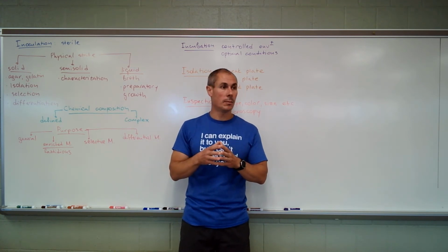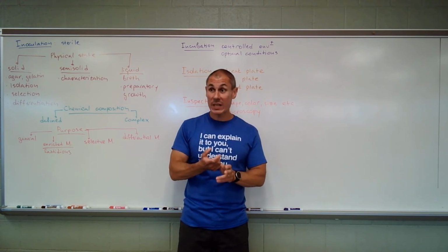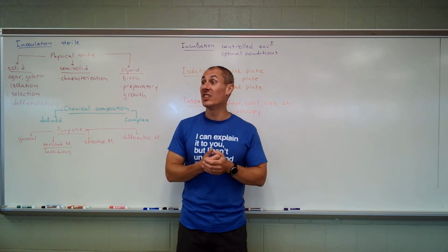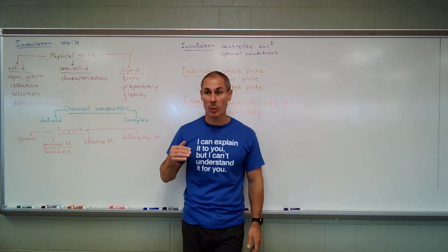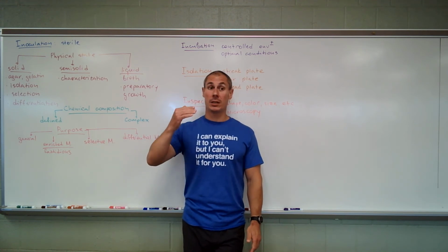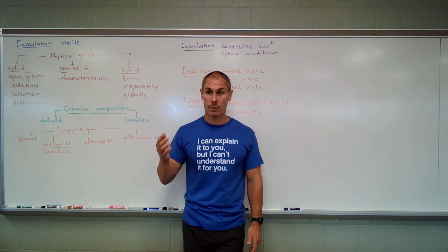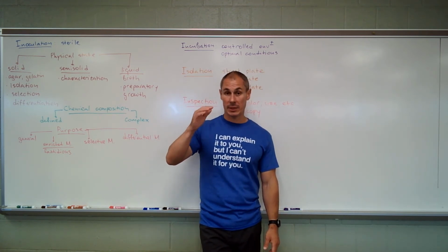And finally, the 2-photon, what you kind of need to know, because it can be a lot, allows you to produce high quality 3D images of living microorganisms in the thick, often living tissue specimens. Does that make sense? It's the best light microscopy we probably have. So you can visualize microbes in the bloodstream interacting with blood cells in real time. What's that? It's 2-photon microscopy. Costs a fortune. $250,000. More than that, actually. One setup. Does that make sense?